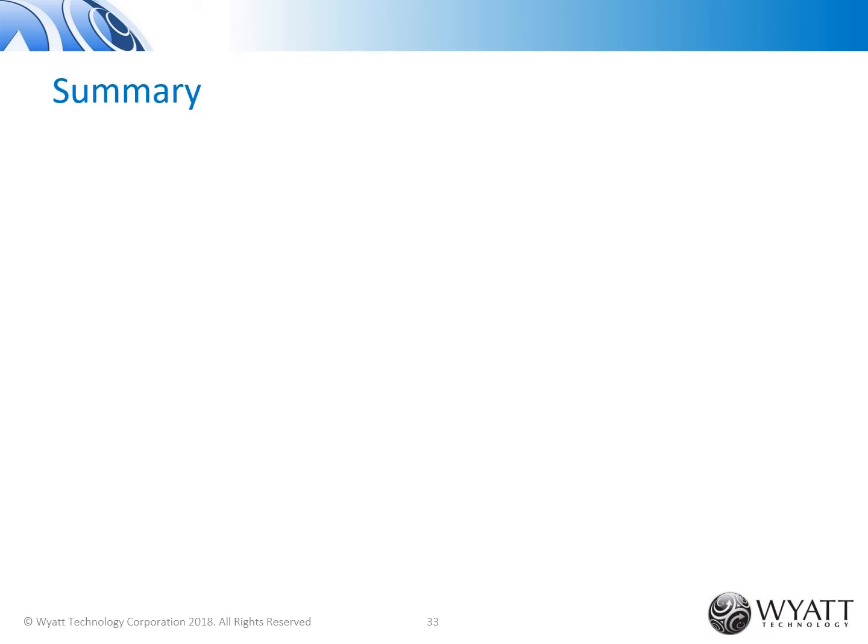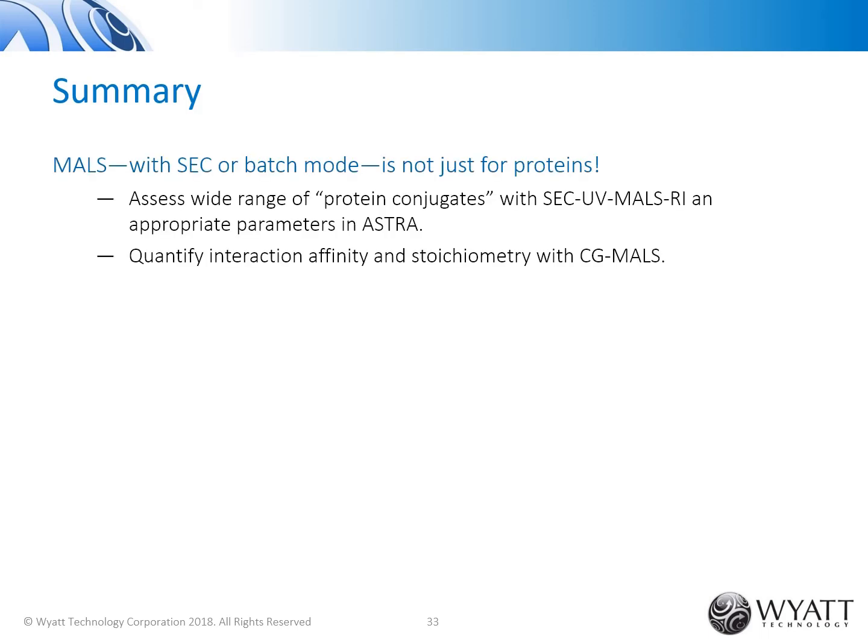So to sum up, I hope I've shown you that light scattering, either with fractionation or in batch mode, is not just for proteins. These same analyses are critical for DNA and RNA and for characterizing nucleic acids in complex with other molecules.